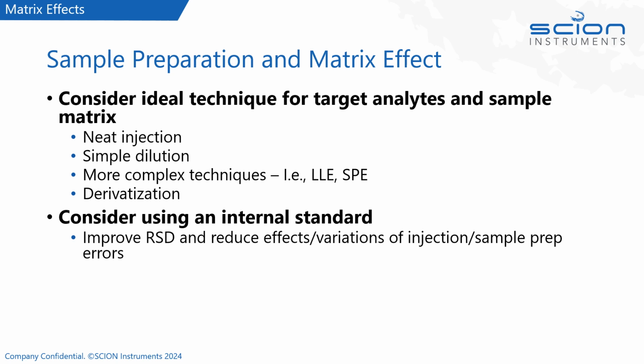This can be really useful and can help improve the variability of your results and can really help reduce any effects or variations of the injection and also of any sample prep errors.